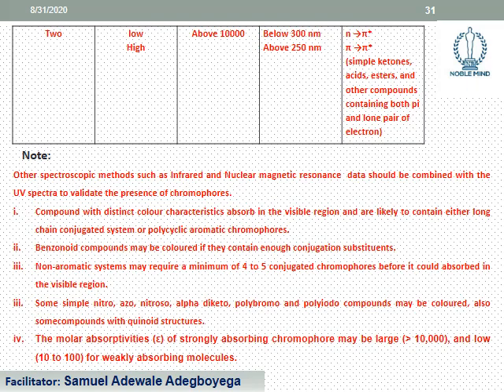So to validate that, you may just need other spectroscopic methods.